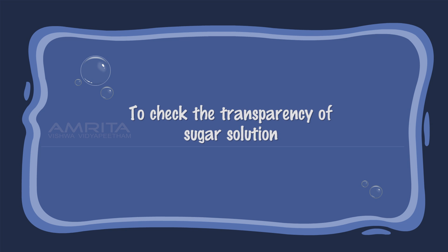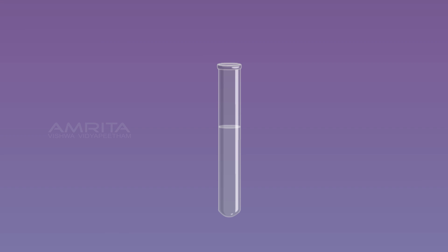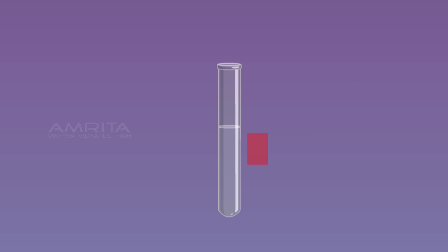To check the transparency of the sugar solution, take some of the sugar solution in a test tube. Paste a small strip of cellophane paper on one side of the test tube and view it from the other side. The cellophane paper is clearly seen from the other side, indicating that a true solution is transparent.